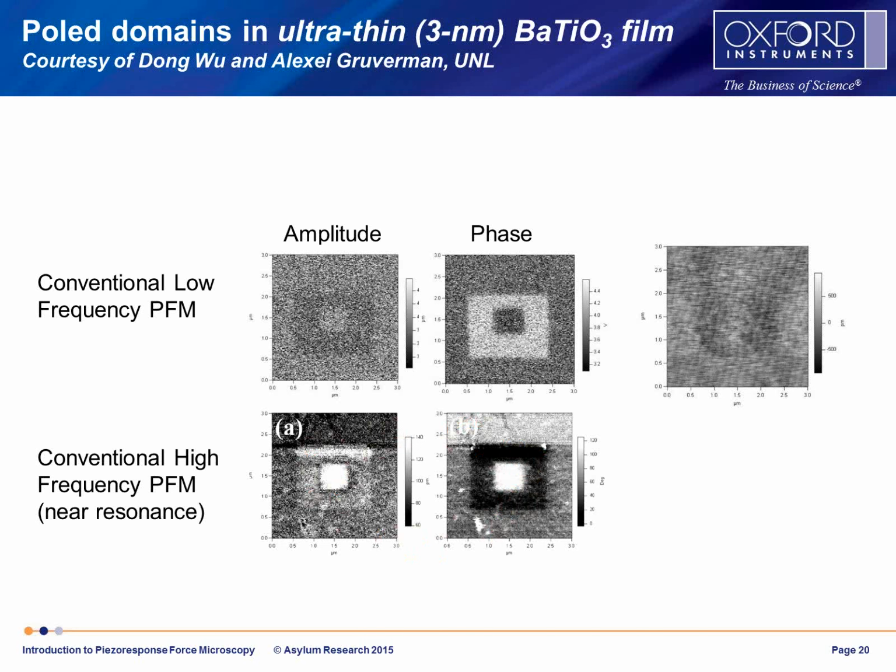I will show you in a little bit what we can do with tracking the resonant frequency to improve on that, so keep this slide in mind. I don't think I showed this before either. Note up here, this is the actual sample topography measured with the AFM. So you can see it's a very flat sample. That scale there is about a nanometer peak to peak. So it's a very flat barium titanate sample.